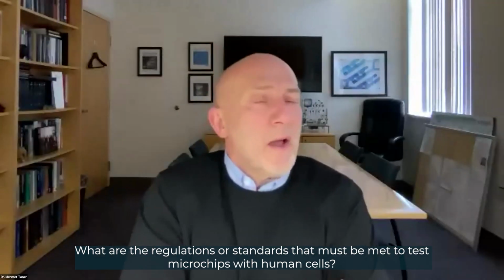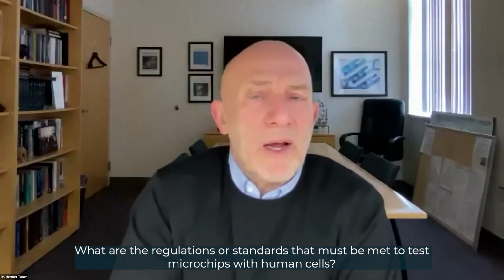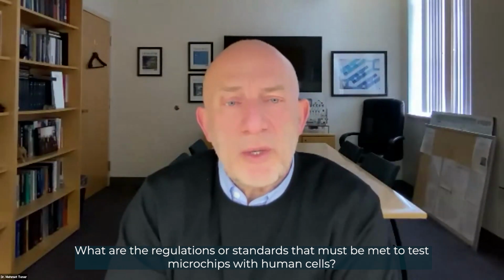Right. The only FDA approval that I know of for a microfluidic chip is for the company Dino Di Carlo started, Cytovale, with AJ Shaw, who was a graduate student in our lab. They got the first microfluidic FDA approval for a test to predict sepsis. So there's going to be more of these.